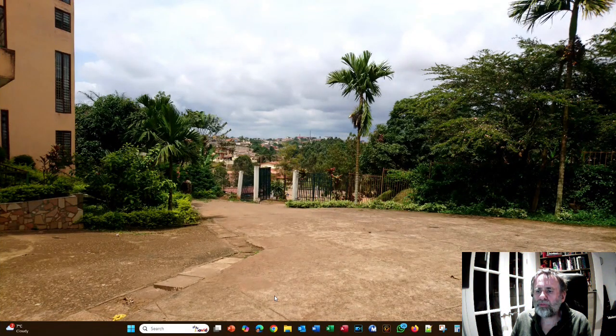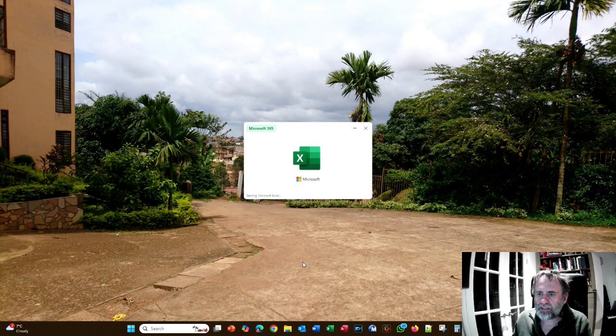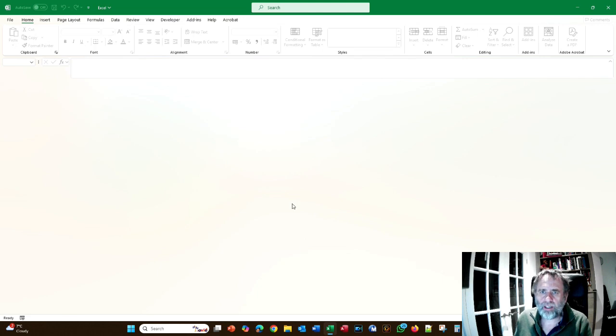Hello and welcome to tutorial 3 of the Platemaker Wizard. So we begin by opening Excel. In order to do tutorial 3 you must have an activated version of the Platemaker Wizard. Activating the wizard was described in tutorial 2.